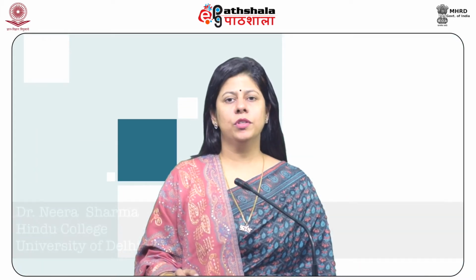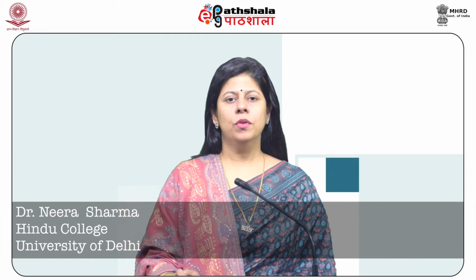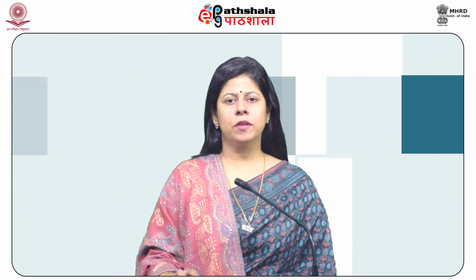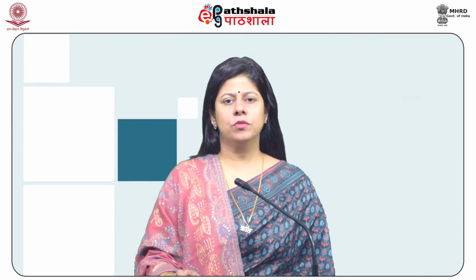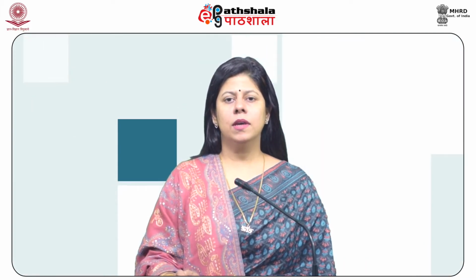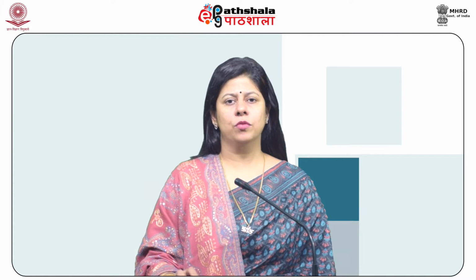After studying this module, you shall be able to know about infrared spectroscopy, the instrumentation required for infrared spectroscopy, and the applications and limitations of IR spectroscopy.